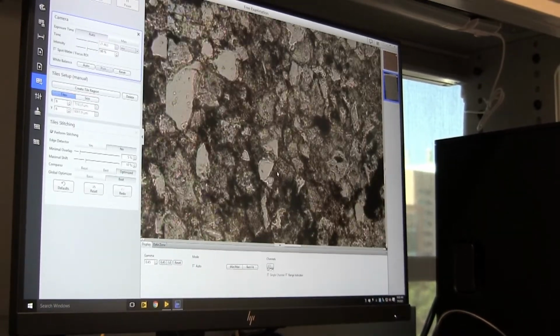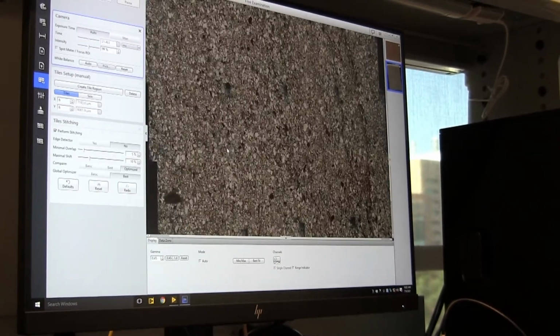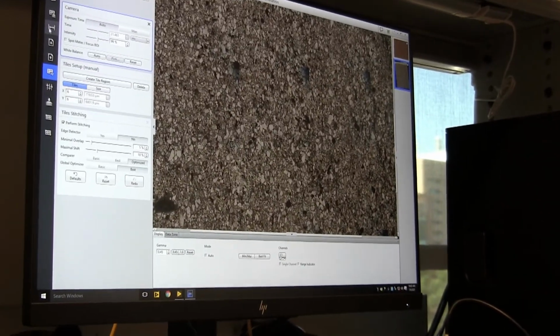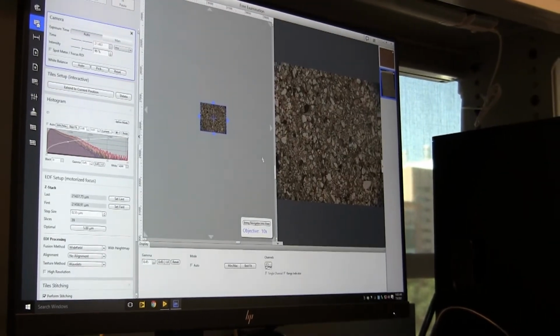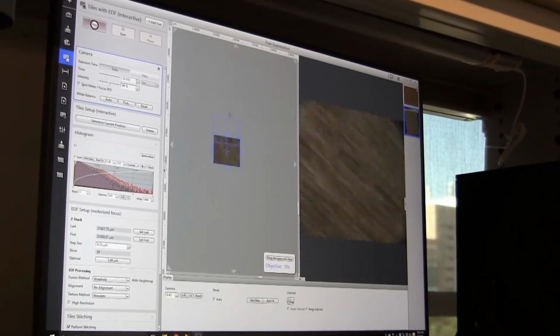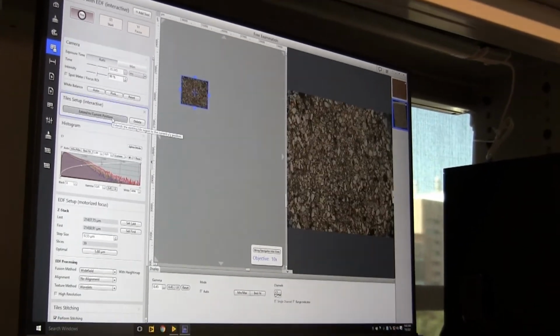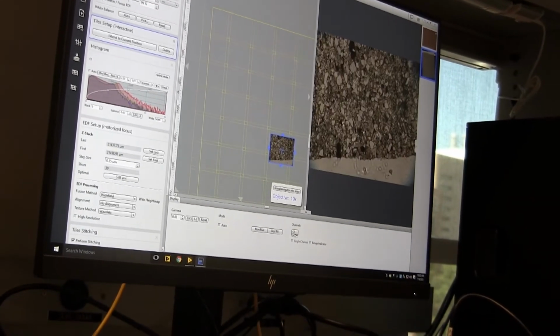But yeah, I think this is it for this microscope. If you want to use any other tiling method, they're also possible, but you just need to start somewhere and extend, and you can also start doing the tiling.